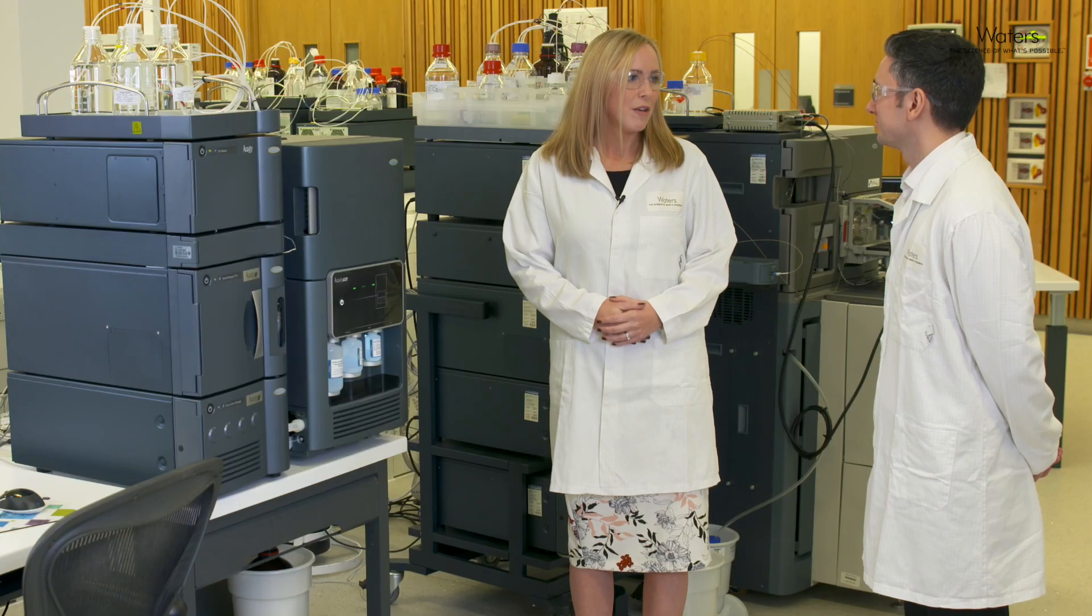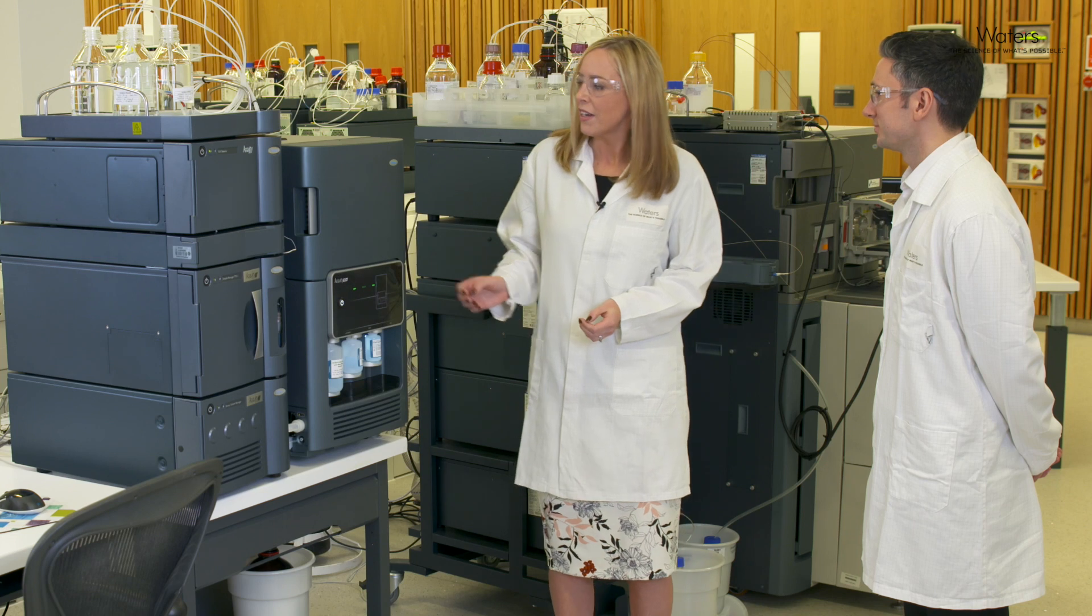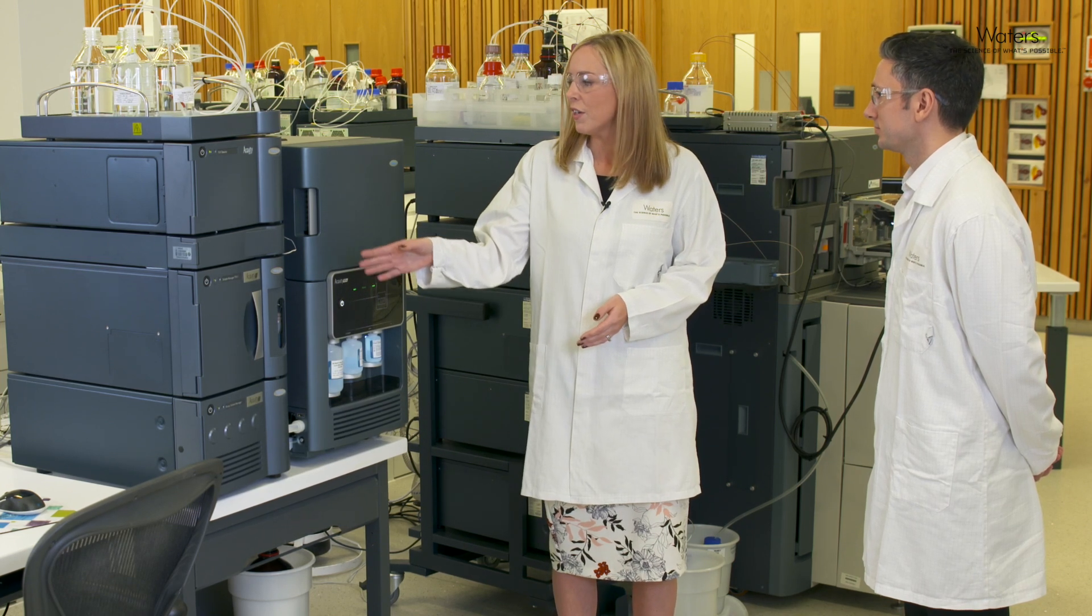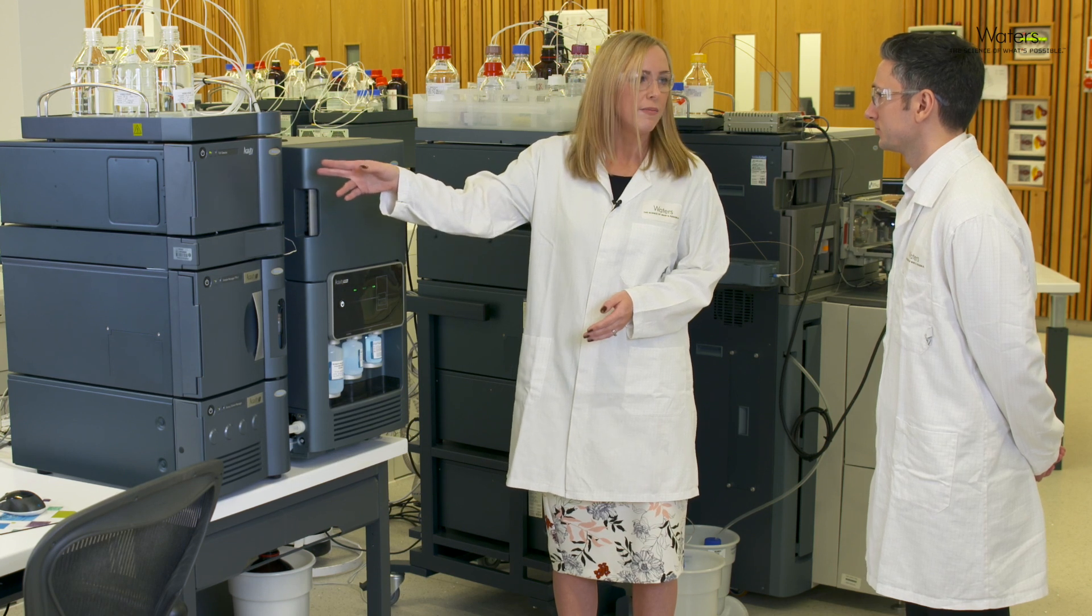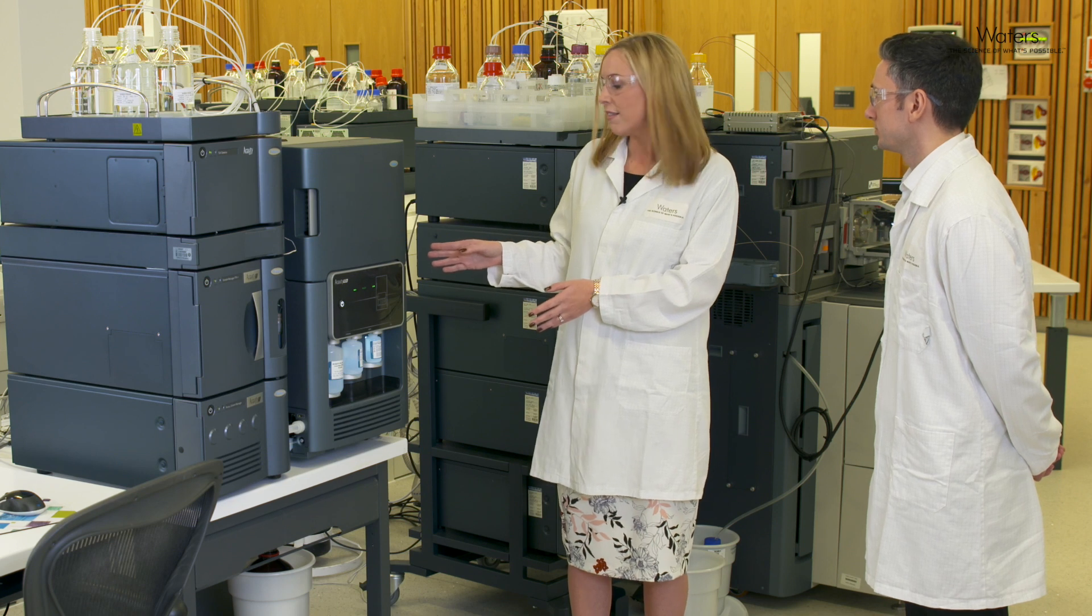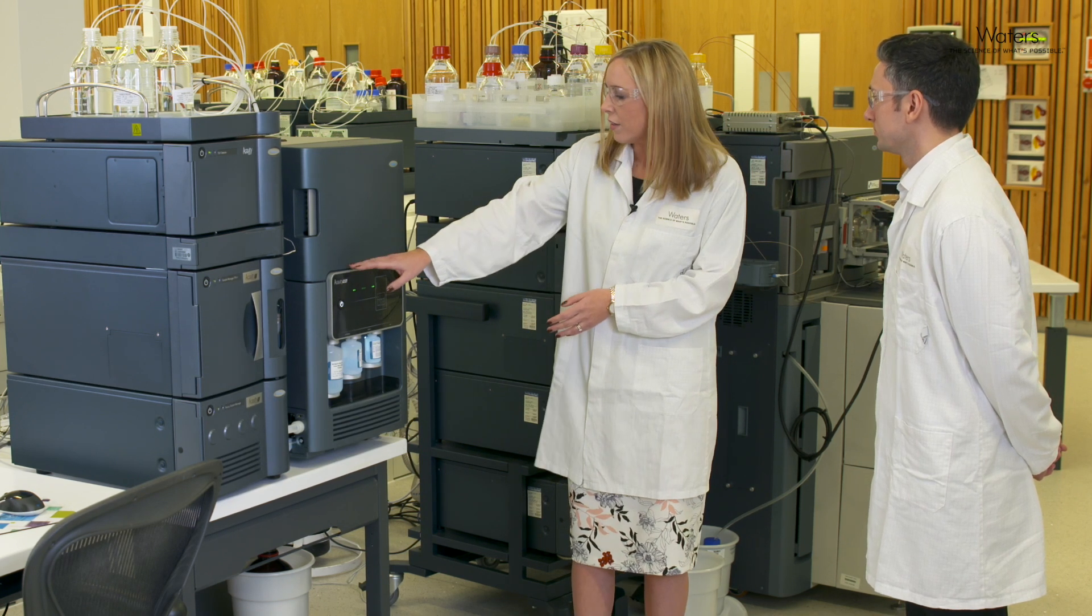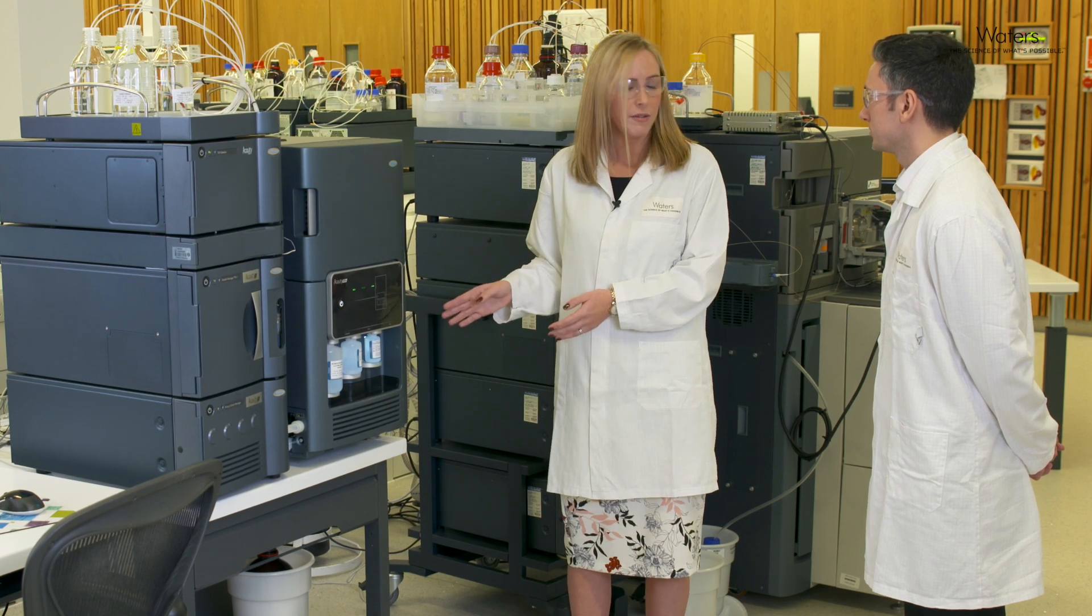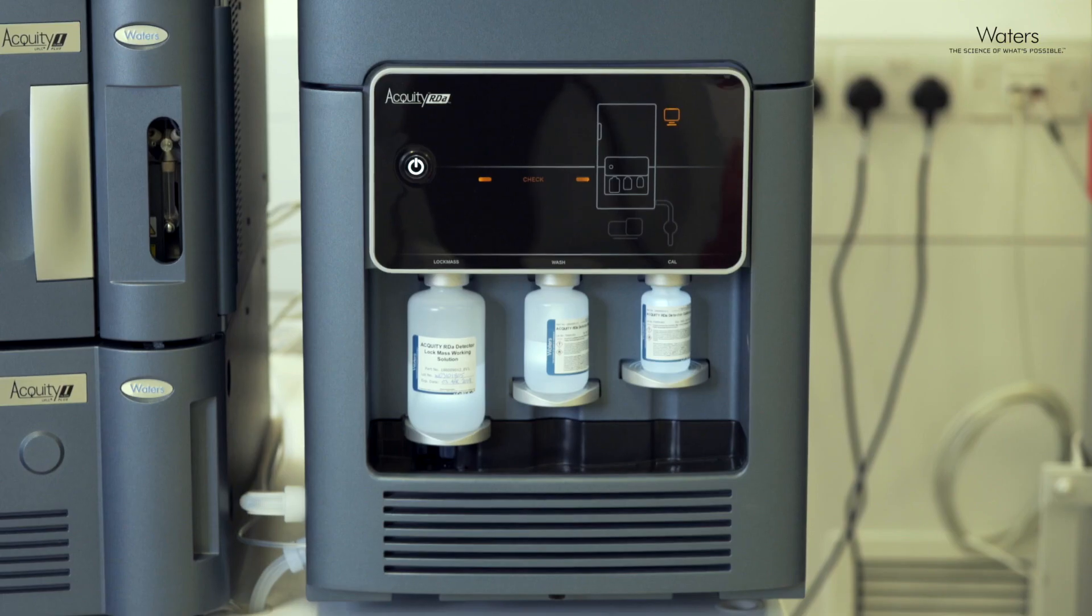So this is the BioAccord system. It's made up of an Acquity i-Class Plus UPLC system with a column heater and a TUV detector. At the heart of the system is the Acquity RDa time of flight mass spectrometer. The RDa has a front panel here which indicates the state of the system whether it's ready, running or it has an error to check.